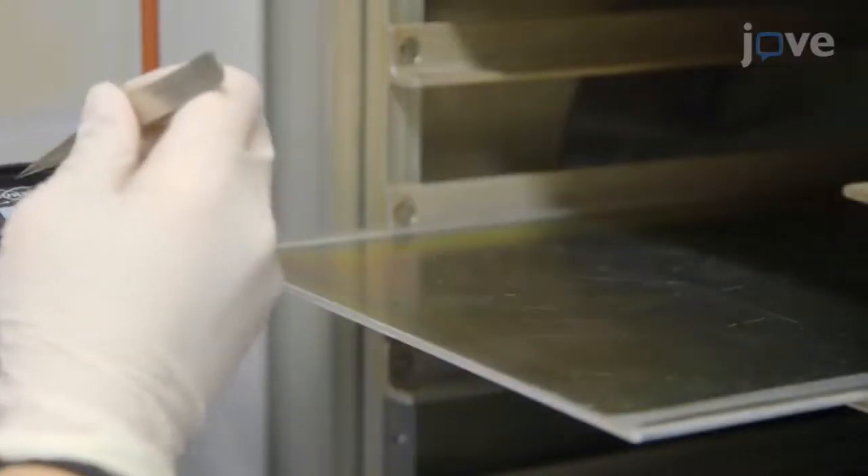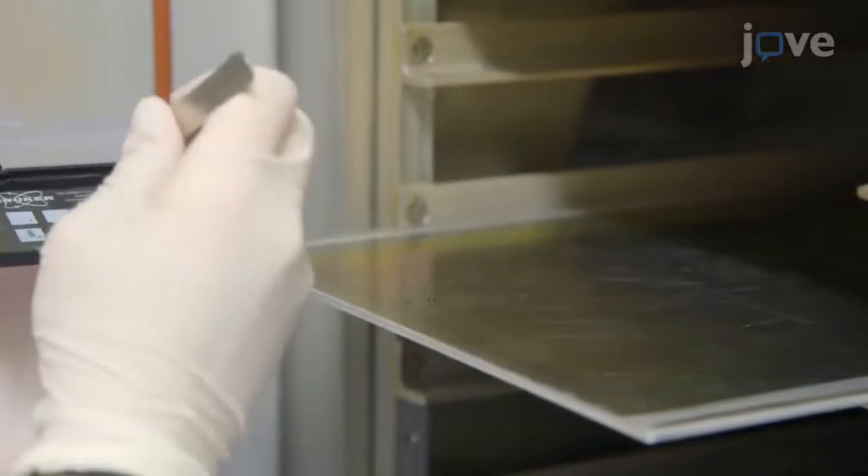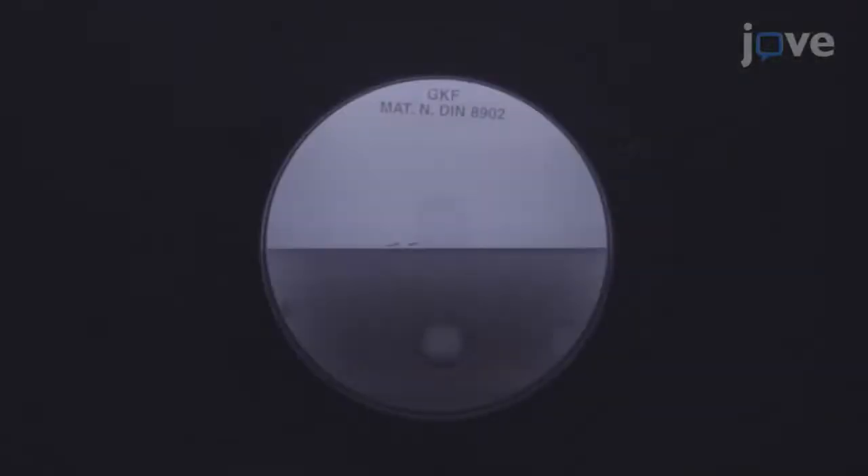First, use freshly cleaned tweezers to place AFM cantilever chips in the plasma chamber. Start the plasma chamber surface activation program by selecting Start and then Yes. Verify that the plasma process is working properly — a plasma process with a high oxygen content shows a light blue color.